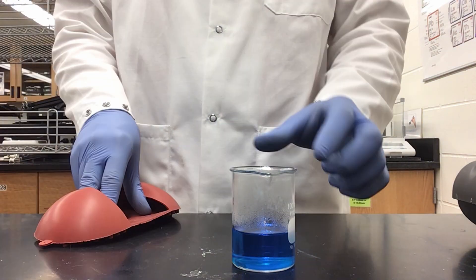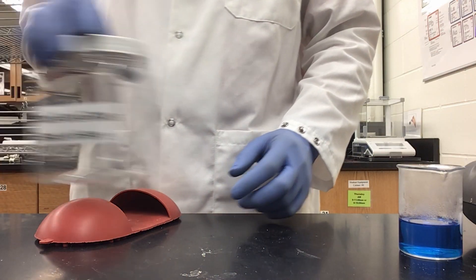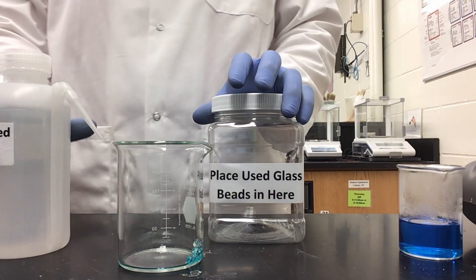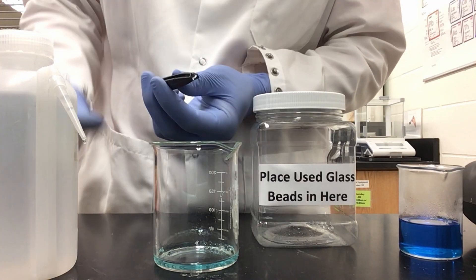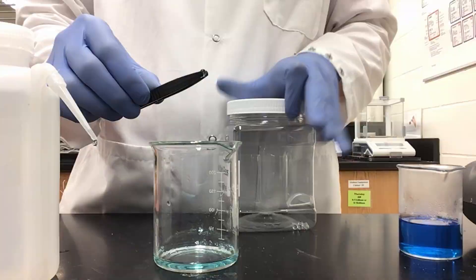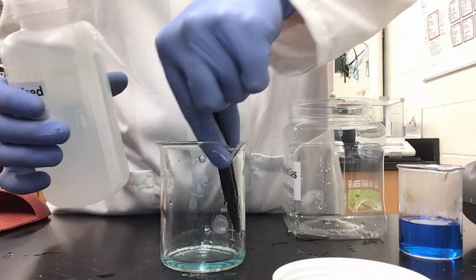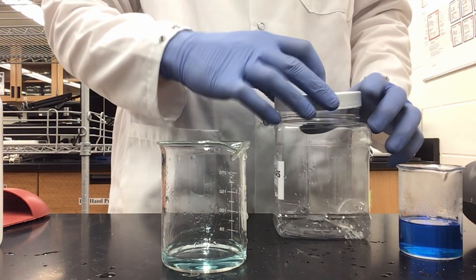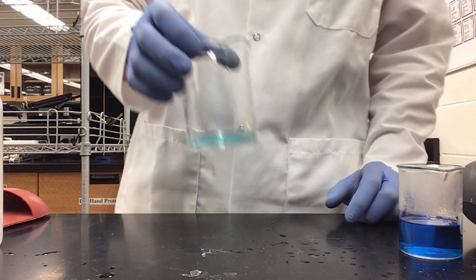I can set the large beaker off to the side, and set my collected solution on the opposite side. Now I need to take care of the glass beads and my beaker. I am going to wash the glass beads in the beaker with just some water — that solution will go into waste. Next, I will pick out the beads, give them a short rinse, and place them into my used glass beads container so they can be thoroughly cleaned at the end of lab and reused. Now I can wash out the beaker and put that solution into waste.